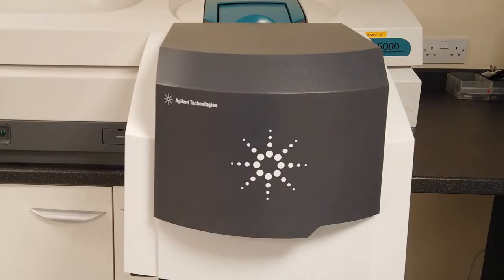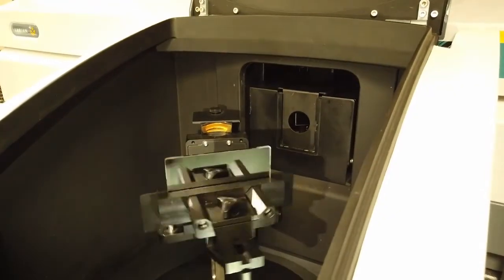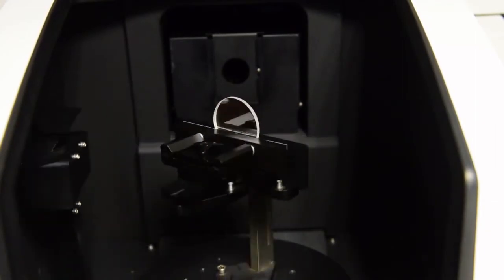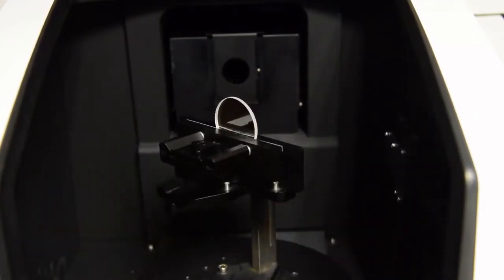Let's take a closer look at the UMA. In the centre we have a sample holder on a pedestal that can rotate around 360 degrees. An optic is placed in the holder — in this case we have an enhanced aluminium mirror.